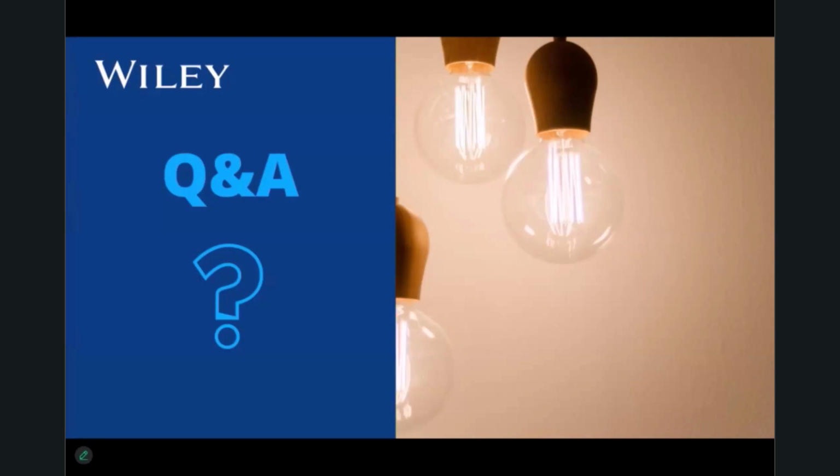Let's see. Is the summary feature in Analyze It new? No, it's been there for a long time. It's always in our training, so please use it.